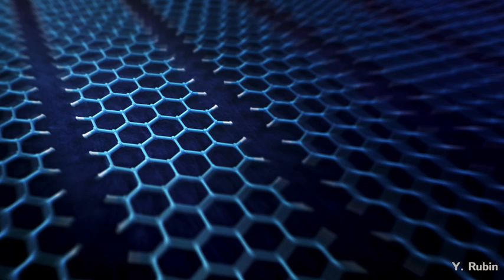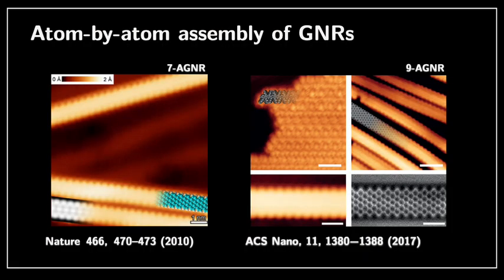And until about 2010, with the work of the group of Roman Fasel and Klaus Müllen, there was a new technique obtained to synthesize those ribbons directly from precursors. And if your precursors are very high quality, you end up with perfect nanoribbons. So there was more work to change the precursor so that you have different types of nanoribbon. And this is very nice for demonstration of Raman, because now the structure you have has essentially no defects. And you can exactly take into account the material with the position of the atoms experimentally and theoretically, and make a match between the two. So that's actually very interesting.